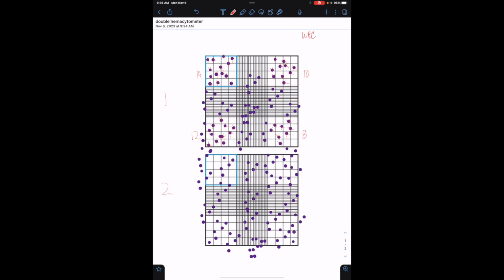Now I have to do some quick math here for you. So 14, 12, 26, 36, and oh wait, did I do that right? Yes, 36, and 8 will be 44. So down here we'll count real quick.